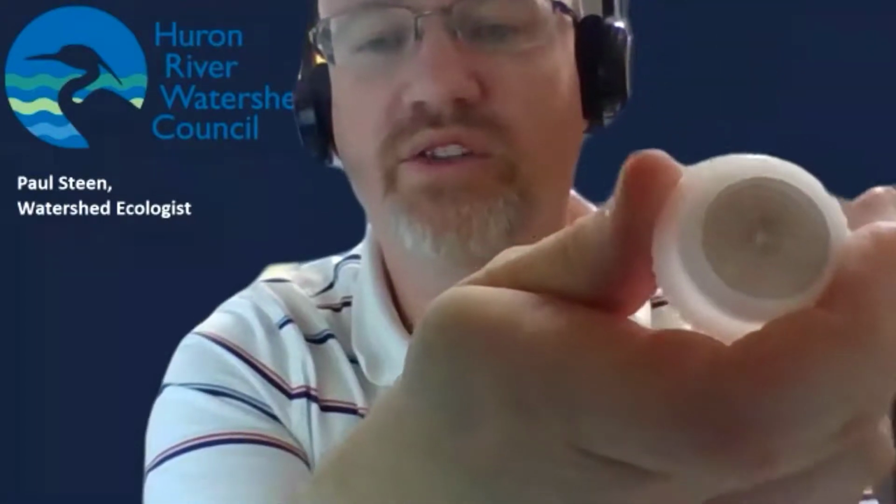So this is the filter holder. This is called the O-ring, which comes right off. And you can see that there's like a little screen right in there. And that's basically, we're going to be putting a little filter in this thing and shoving the water through that screen.